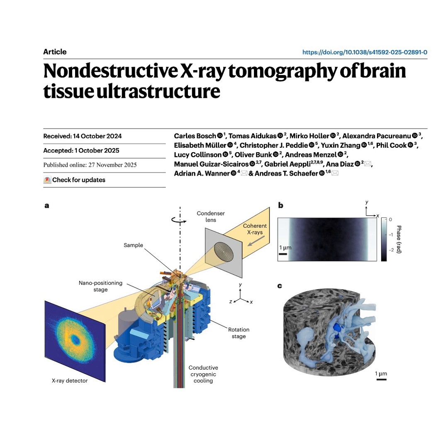That's credible. But for the average lab trying to use this, how practical is TGPAP? Is borrowing from the nuclear industry going to introduce all these new complexities or crazy costs? That's a great question. For moving from a proof of concept to a standard tool, the material itself is specialized, yes, but the actual embedding process is basically the same as with traditional epoxy. So the workflow isn't that different? Not radically, and the benefit of being able to image huge volumes non-destructively probably offsets the material cost when you compare it to weeks of manual labor for sectioning.